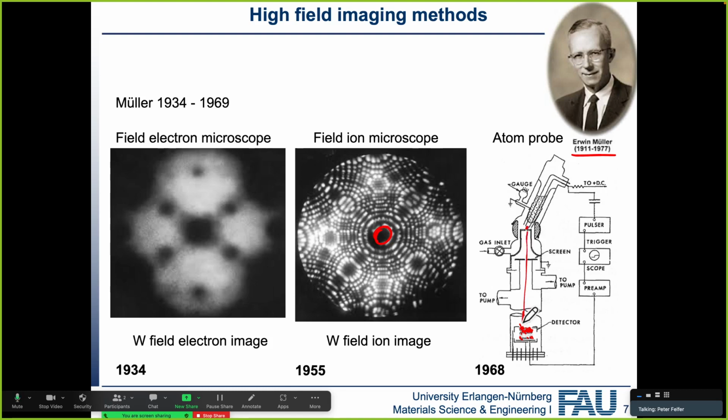And then your ions can fly down the drift tube, and then you can analyze which ion is which. These style of atom probes are obviously no longer used, and they weren't used for very long, mainly because you have a combination of high voltage, glass, and liquid hydrogen as a coolant. And as you can imagine, safety-wise, that's not really a great combination. That's why these days we don't have glass atom probes anymore.